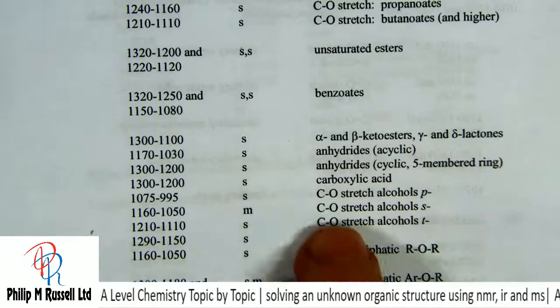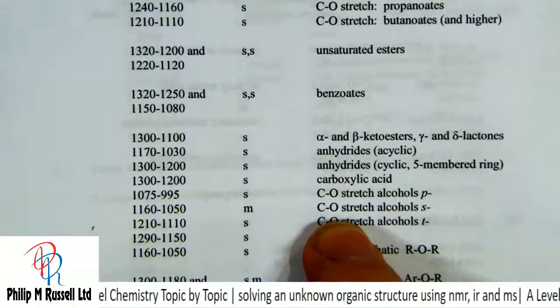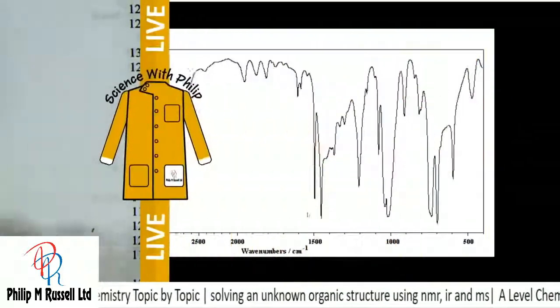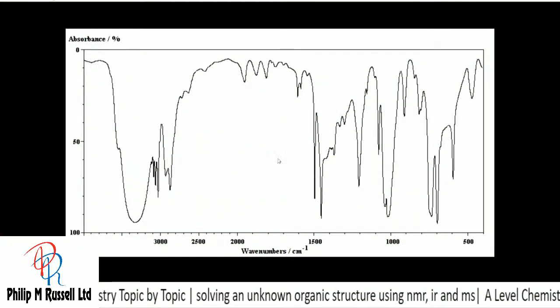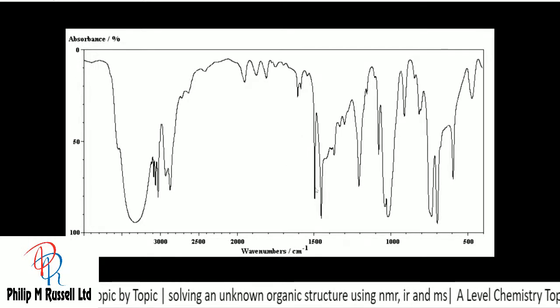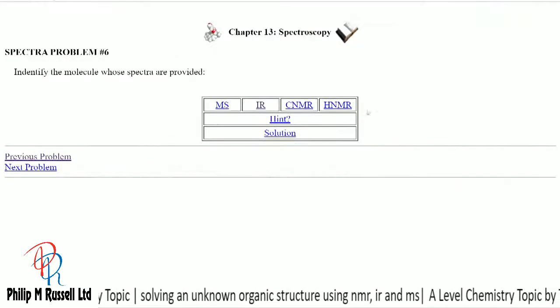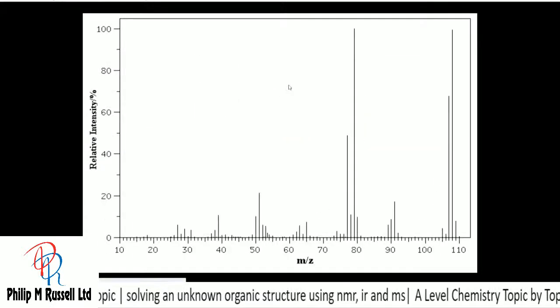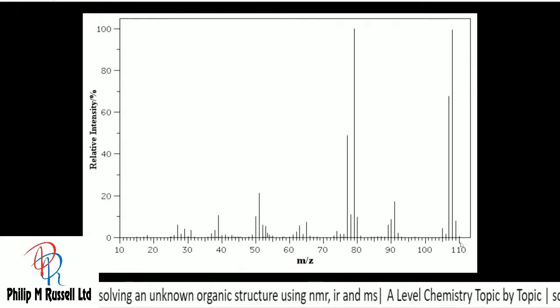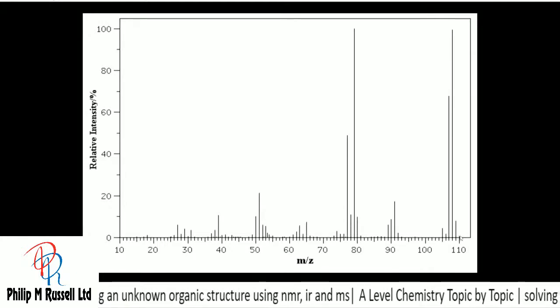Now, my favourite, look for the carbonyls, the C double bond O. That's going to be around about 1700. So back on the spectra, there is nothing there at 1700. Nothing. So a carboxylic acid is looking not likely at the moment. Okay, fine. Good. So that's all we've got from that. Now let's peek at the mass spec, and so we've got 100, 110 is the molecular ion, I reckon. No, a bit less. I reckon it's the 108.